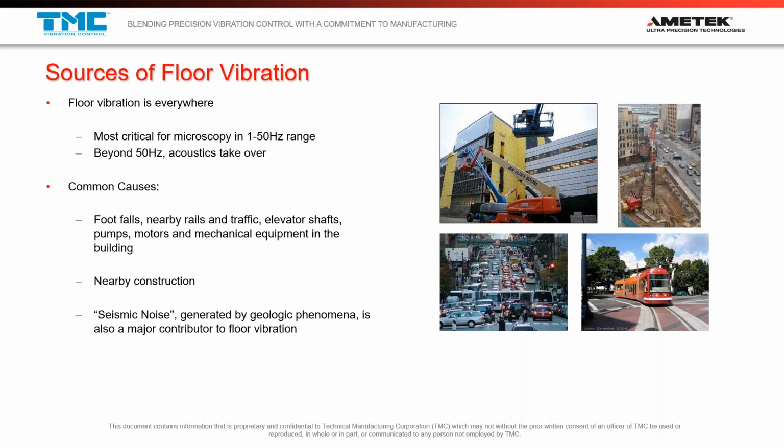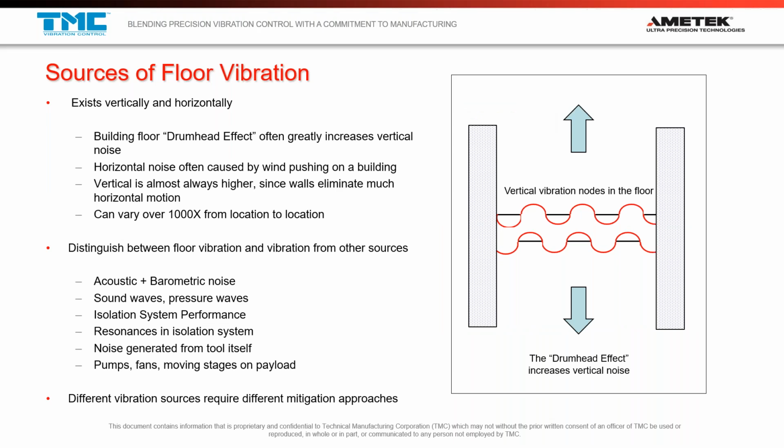Floor vibration is everywhere. It's in cities. It's in the middle of a field. It's in a factory isolated from any other external sources, because that factory, like a semiconductor manufacturing facility, is going to be filled with instruments. So you have your external sources, you have your internal sources, and you have all sorts of input into the floor, which is causing floor vibration. It's most critical for microscopy in the 1 to 50 hertz range.